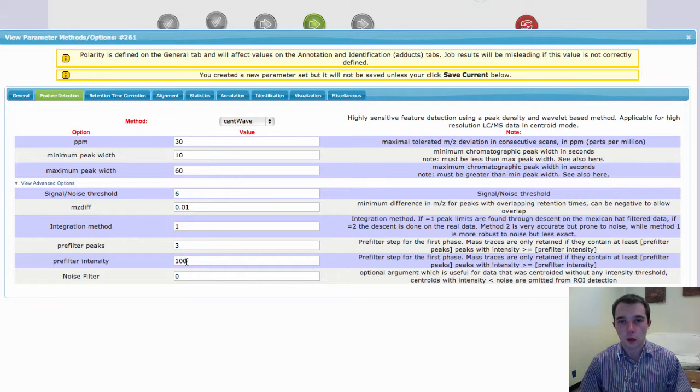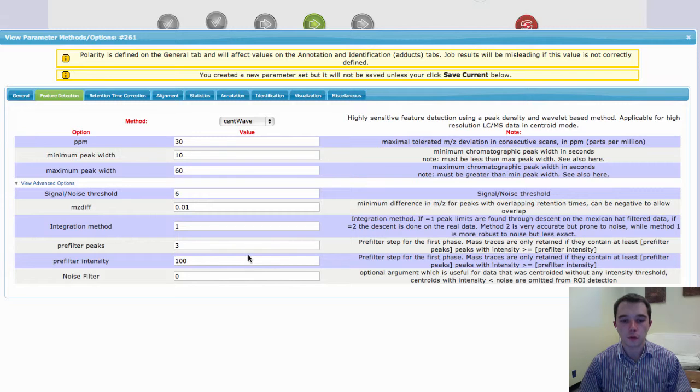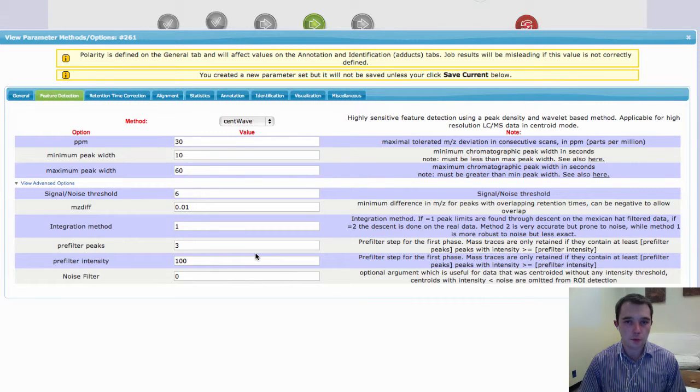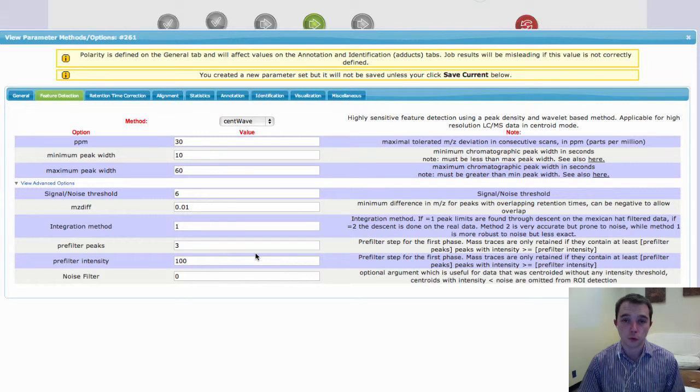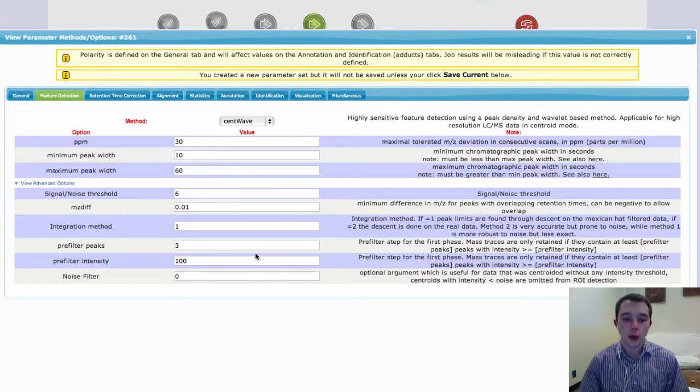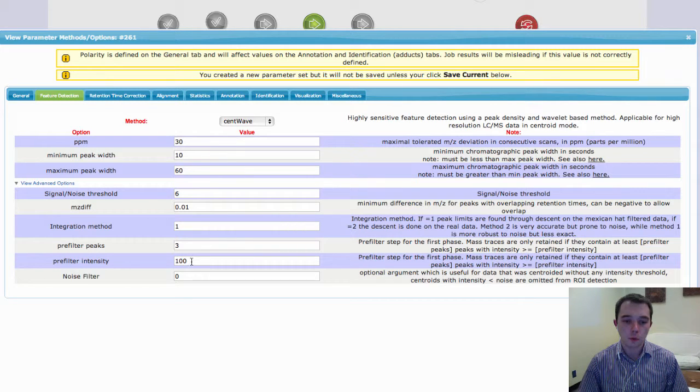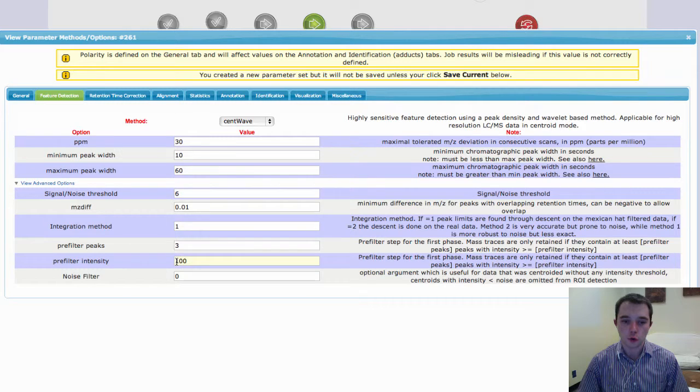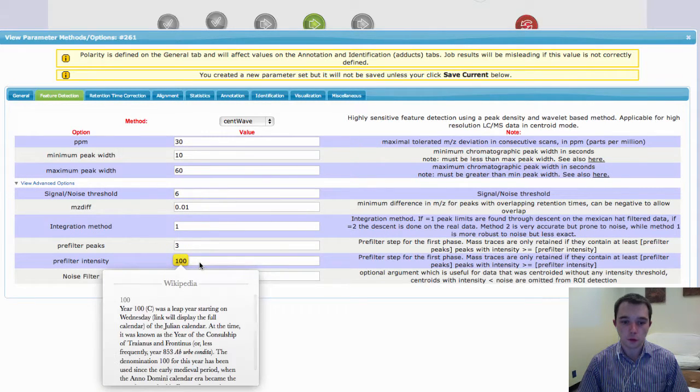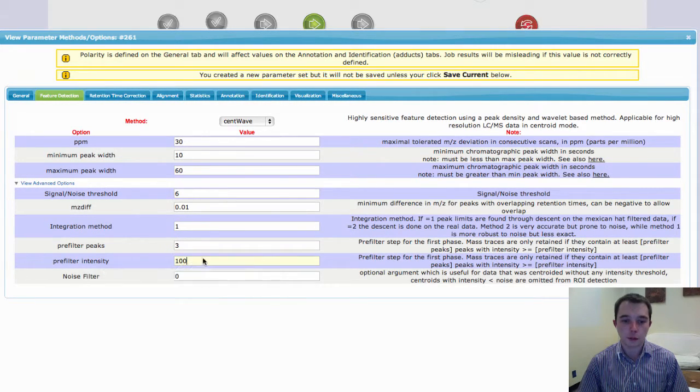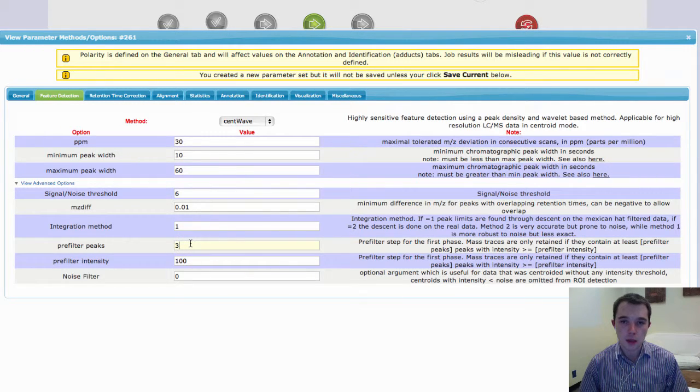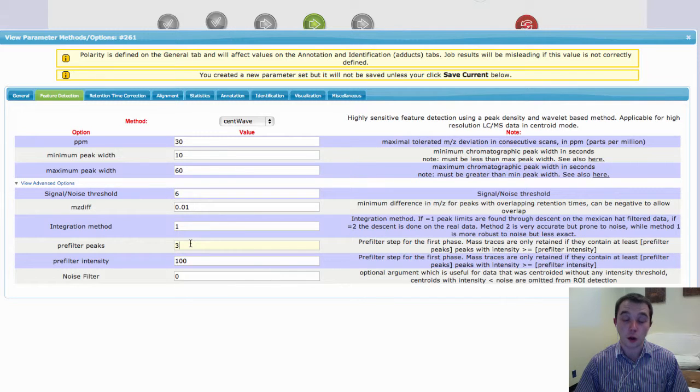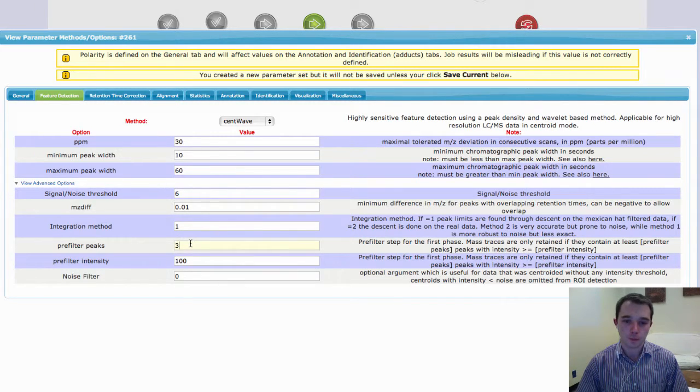The other thing that I want to just touch on here quickly is this pre-filter idea in CentWave. Just because this is used quite a lot, and it depends upon your instrument, how long your scan rate or duty cycles are. And so essentially what the pre-filter is saying is that we need a minimum of 100 counts for each one of your scans. And you need that peak to be up above 100 counts for a minimum of 3 scans.